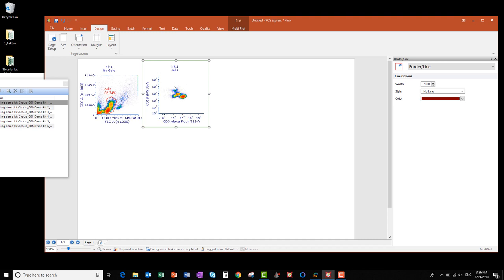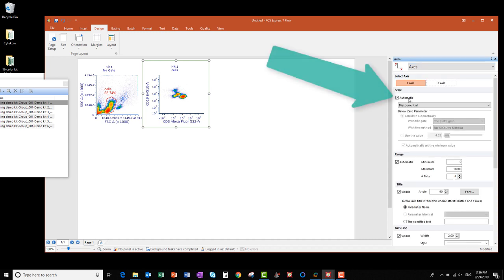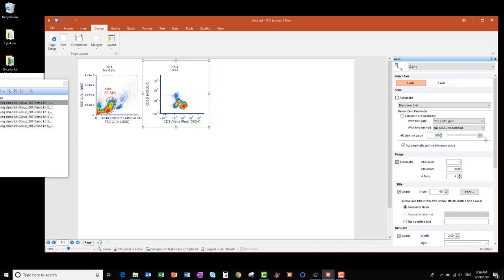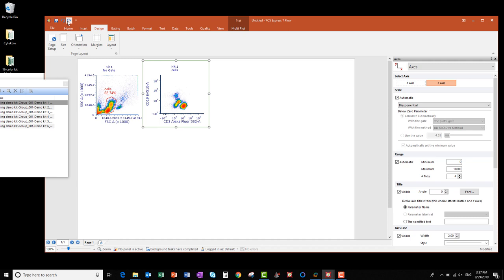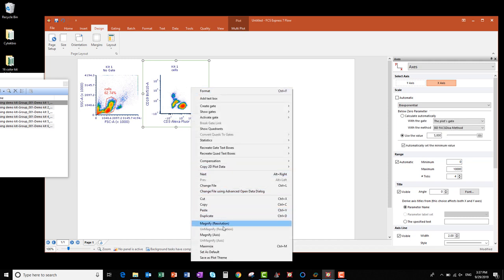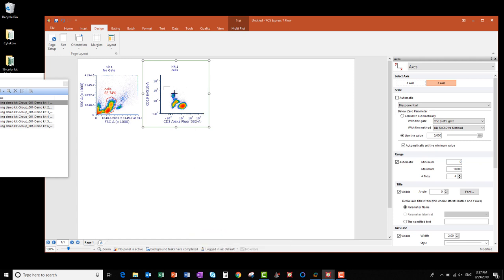I'm not happy with the scaling of the data, as it's very squished and there is a lot of white space on the plot. To change the scaling, go to the Formatting window and choose Axes from the drop-down list. For the Y-axis under Scale, uncheck the box next to Automatic, then under the Below Zero parameter, change the selection to Use a value I specify. If I increase it all the way to 5000, the visualization already looks better. I'll do the same for the X-axis — uncheck the Automatic box, select Use the Value, and increase it to 5000. If you don't like your changes, you can always use the Undo button to revert, and the Redo button to return. To further improve the scaling, I can right-click on my plot and click Magnify Axis, then click and drag the region of the plot I want to magnify.